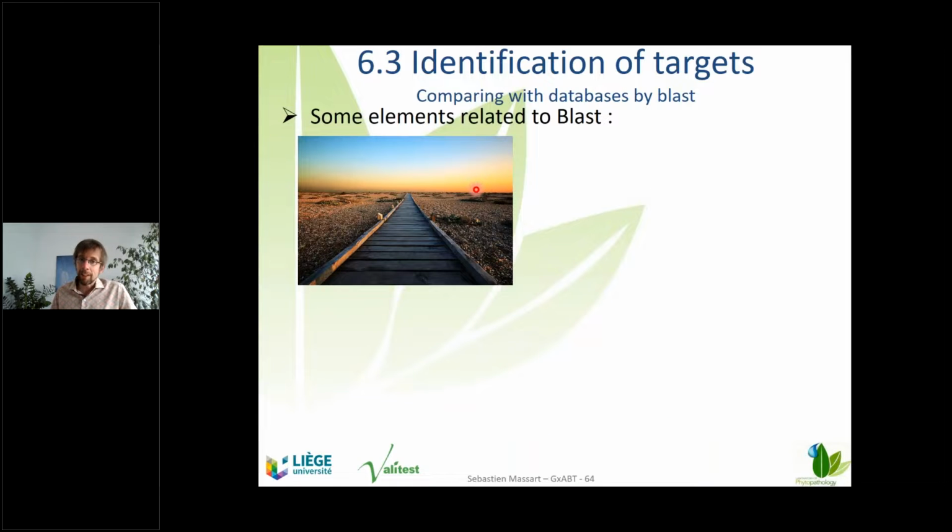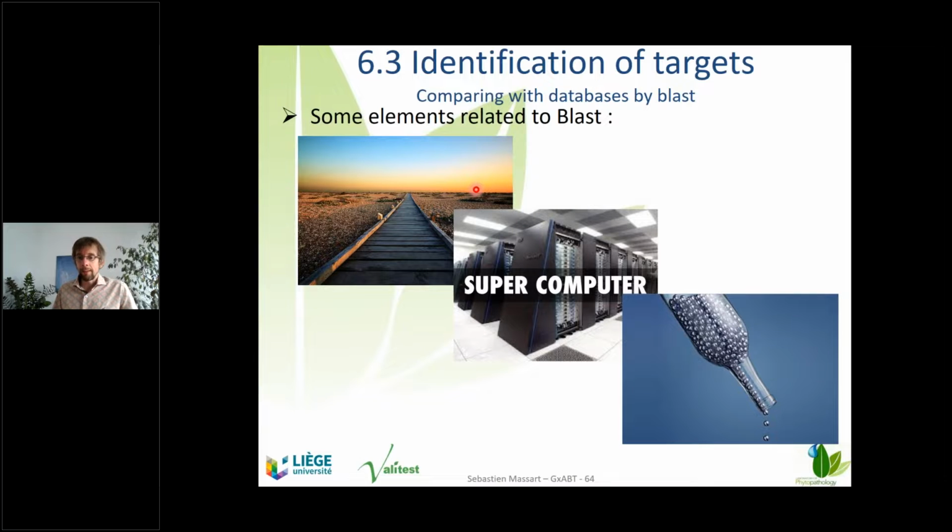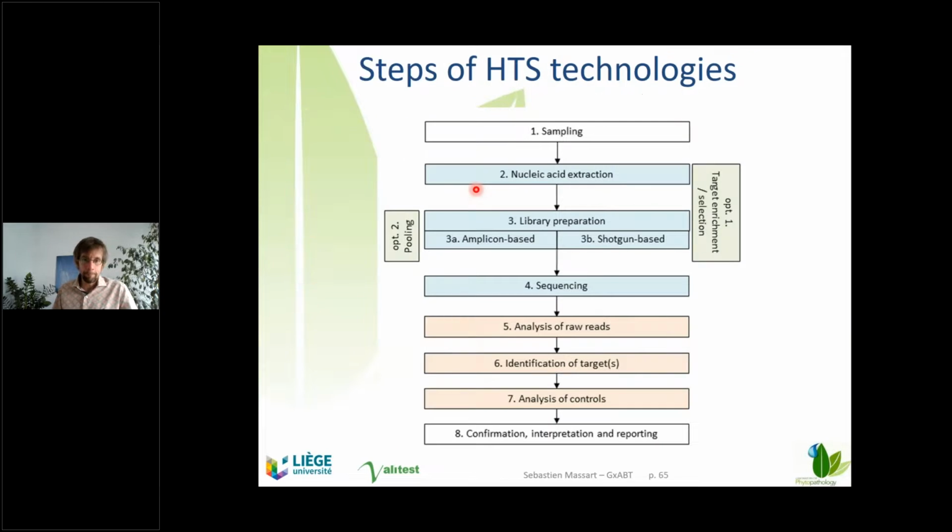BLAST is currently the longest step. It takes a lot of computing power. You need a lot of resources, and it's the bottleneck of the analysis. That's why a lot of new algorithms are being developed to speed it up.